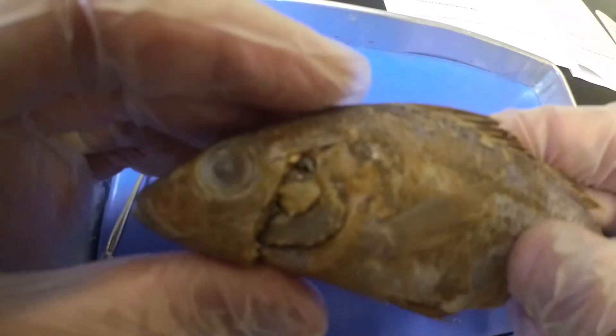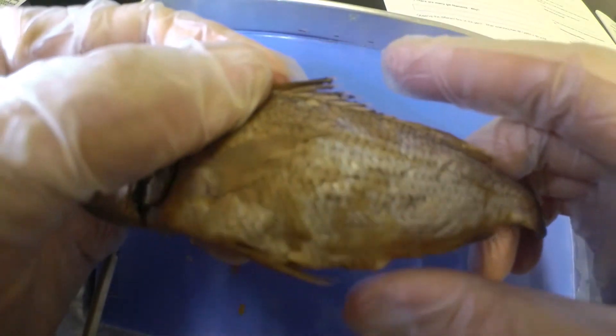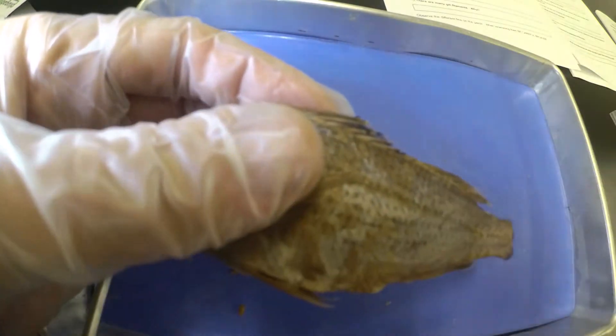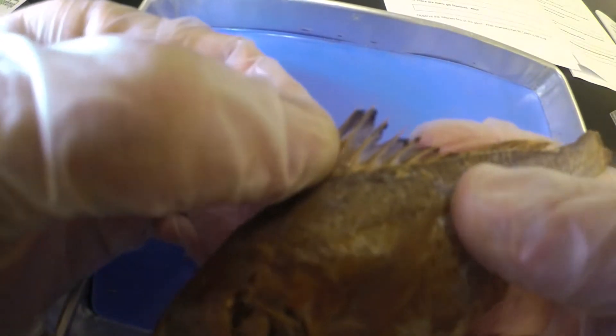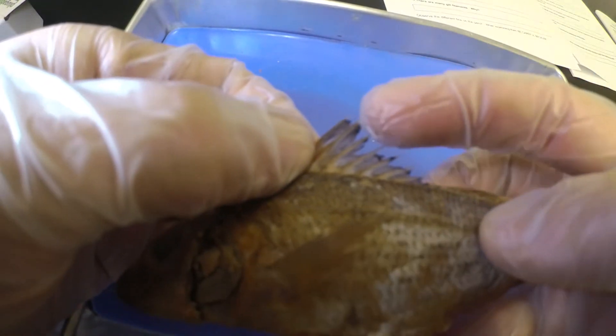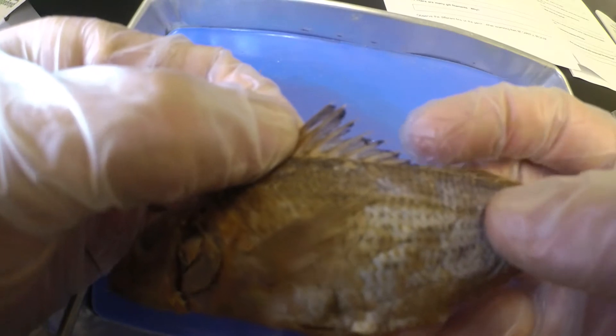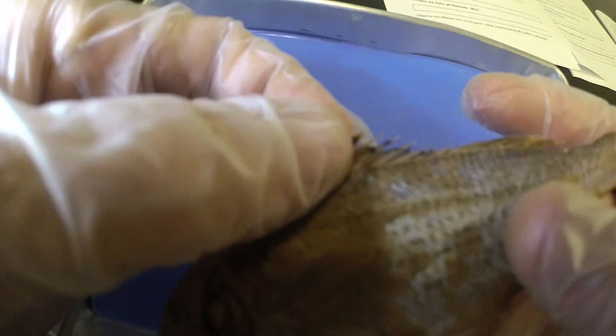What that's really useful for is if something's trying to eat the fish — if something is in front of it, it can see it coming and try to avoid it. If something's coming from the back to eat it, those spines are not going to feel good in the mouth. Next we want to count how many spines there are: one, two, three, four, five, six, seven, and eight on the anterior dorsal fin.